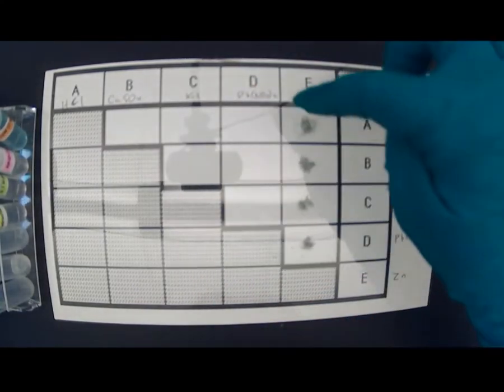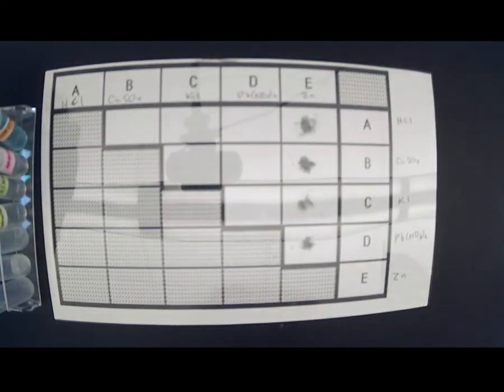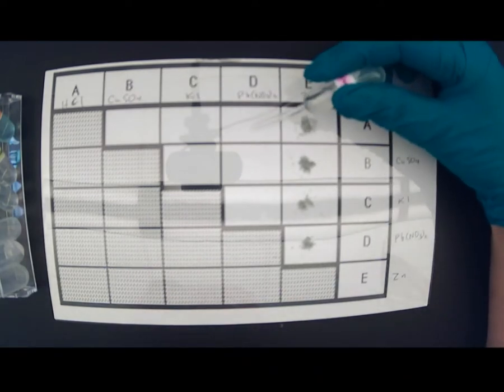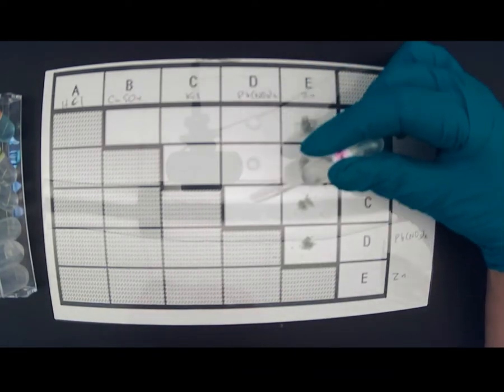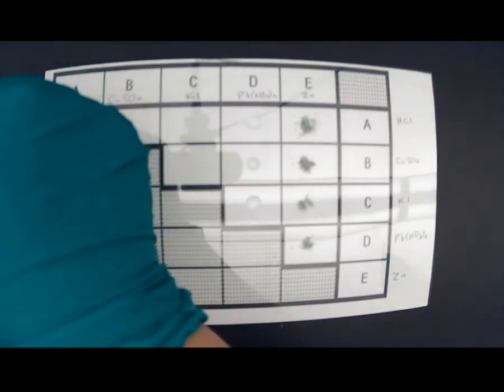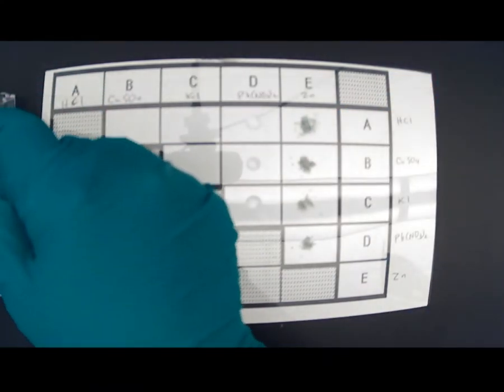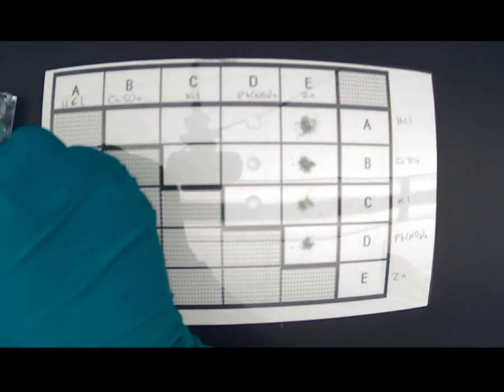On the second to last column it says lead nitrate, so I'm going to do that column first. I'm just adding one drop each — one, one, one. Okay, so that was my lead nitrate column.